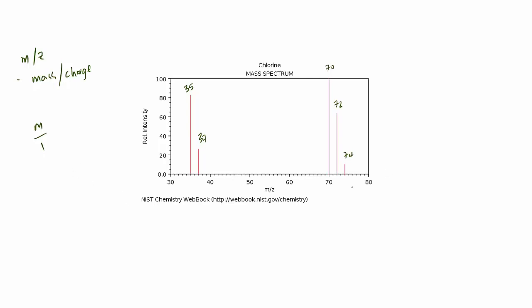Okay, but it is an m/z ratio on the axis here. Now they've called this one relative intensity. In an exam, you'd probably get this called relative abundance rather than intensity. Note that it is not a percentage scale. If it were, then this would be all over the shop, because this here is at 100.